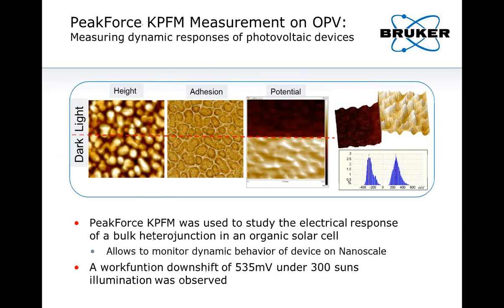Now let's go to a photovoltaic device here. Again, organic photovoltaic devices and OLEDs are very similar, and a lot of the methods, if they're applicable to one, they're applicable also to the other one.